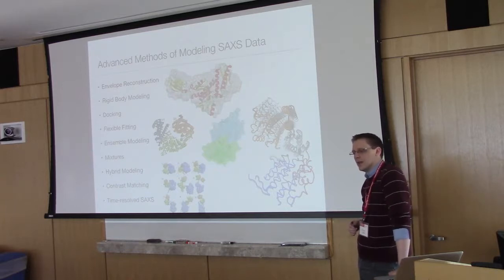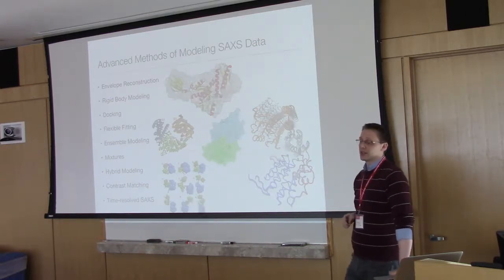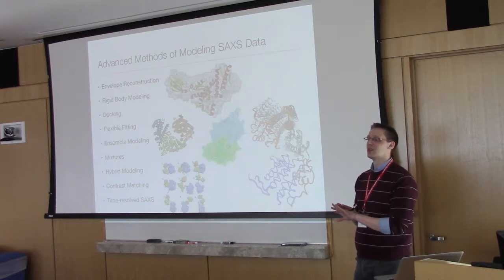Suppose you have a protein that has two helices and they are almost identical but slightly different. Well, it's going to depend on how slightly. Remember, it's a low resolution technique, so things that are slightly different at 20 angstrom resolution don't actually look different. So you just keep that in mind.